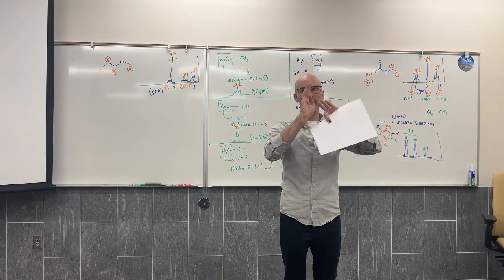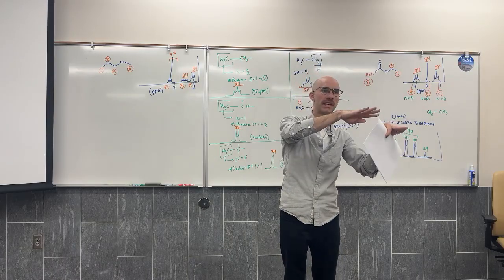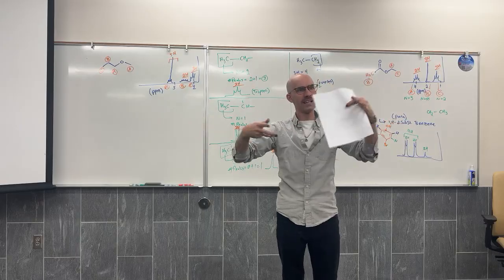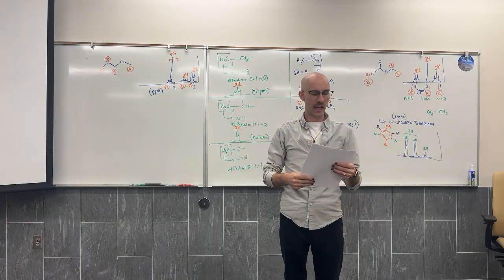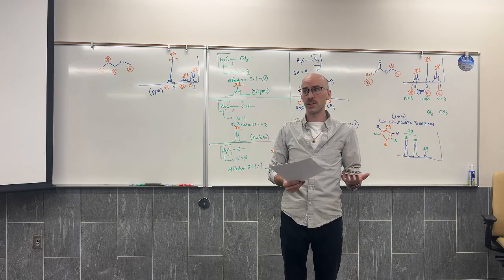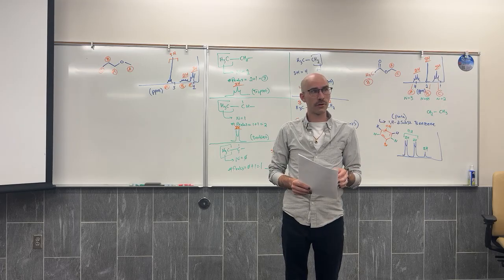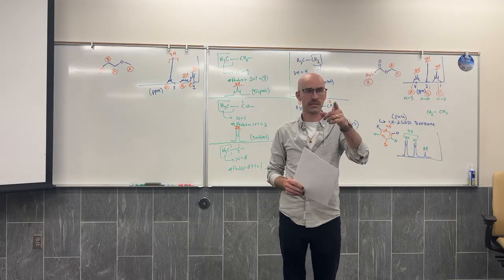A lot of the overlaps are more like offset overlaps. So one peak is overlapped with another peak, and then you just get this weird mix. And obviously people care a lot about this instrumentation, this analysis method, so they've devised the tools to be able to separate them.